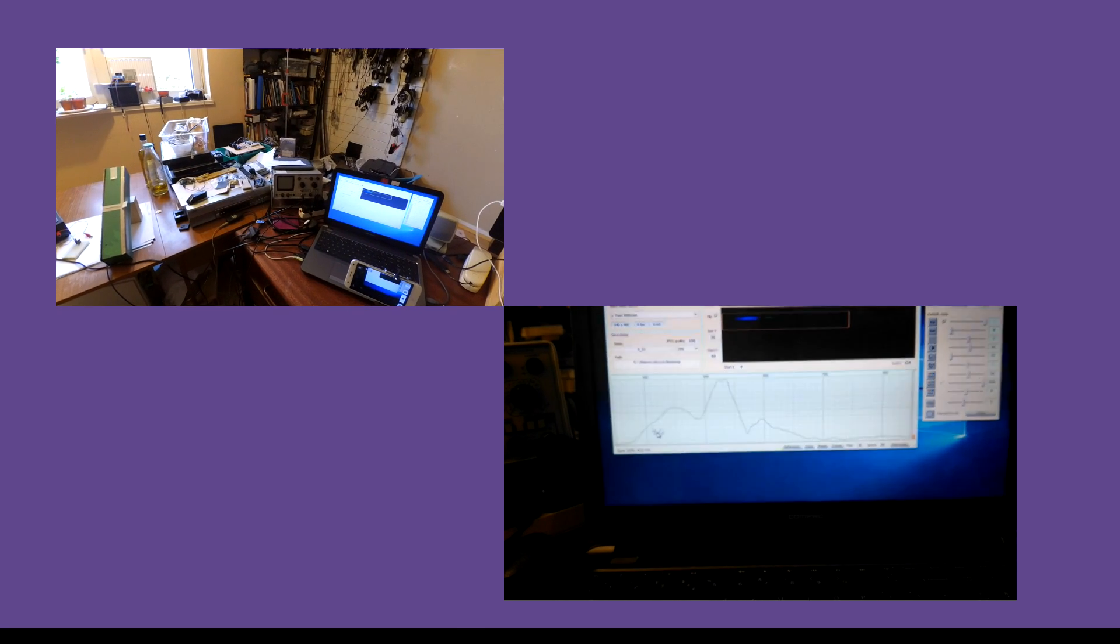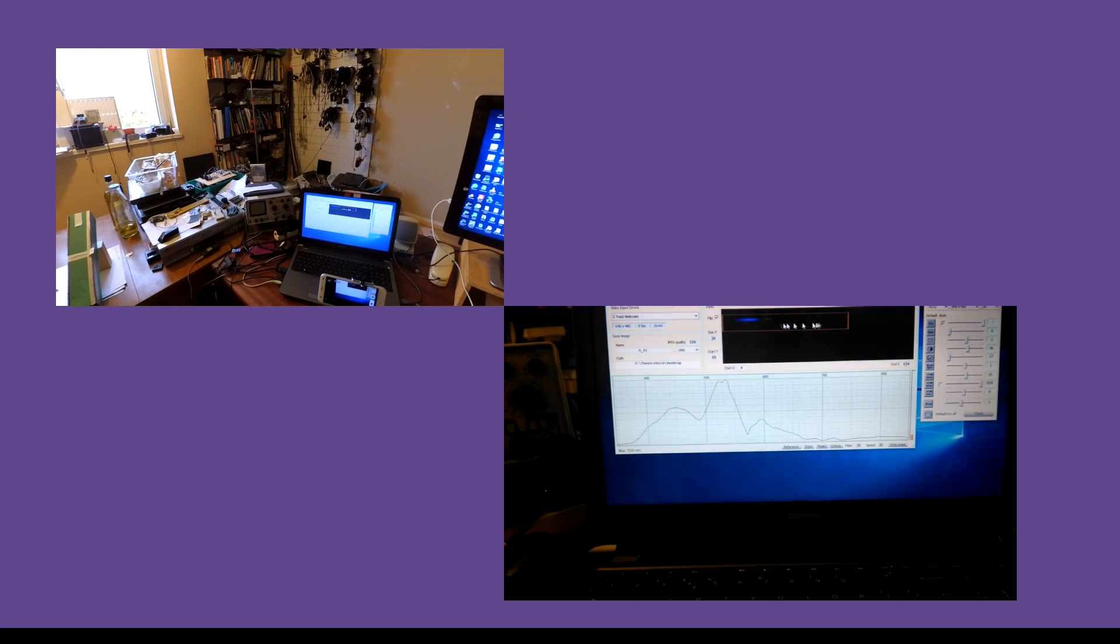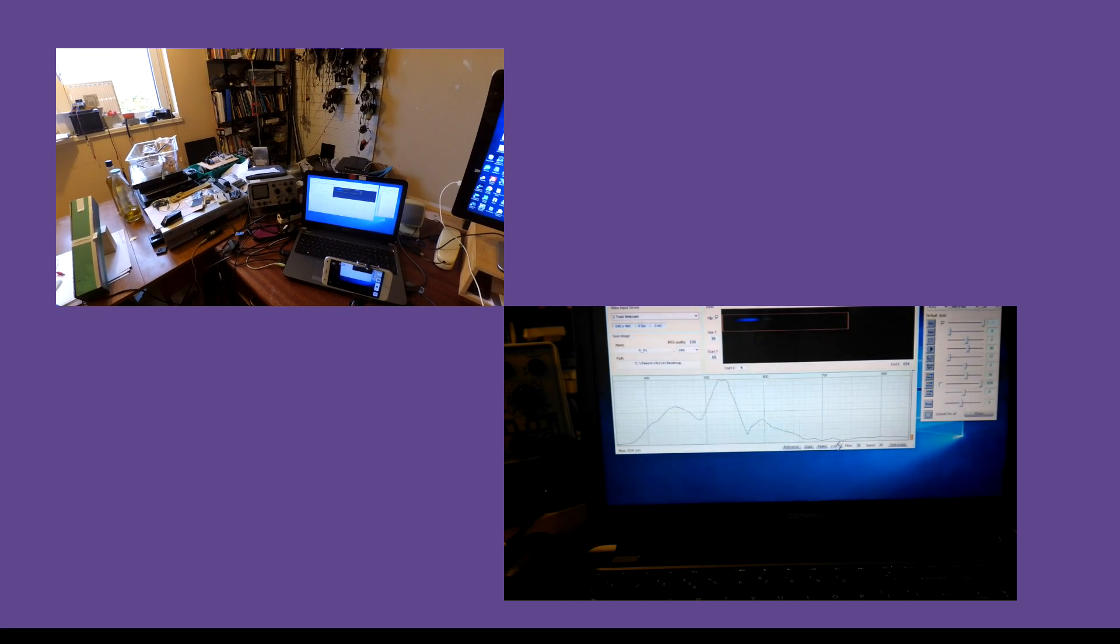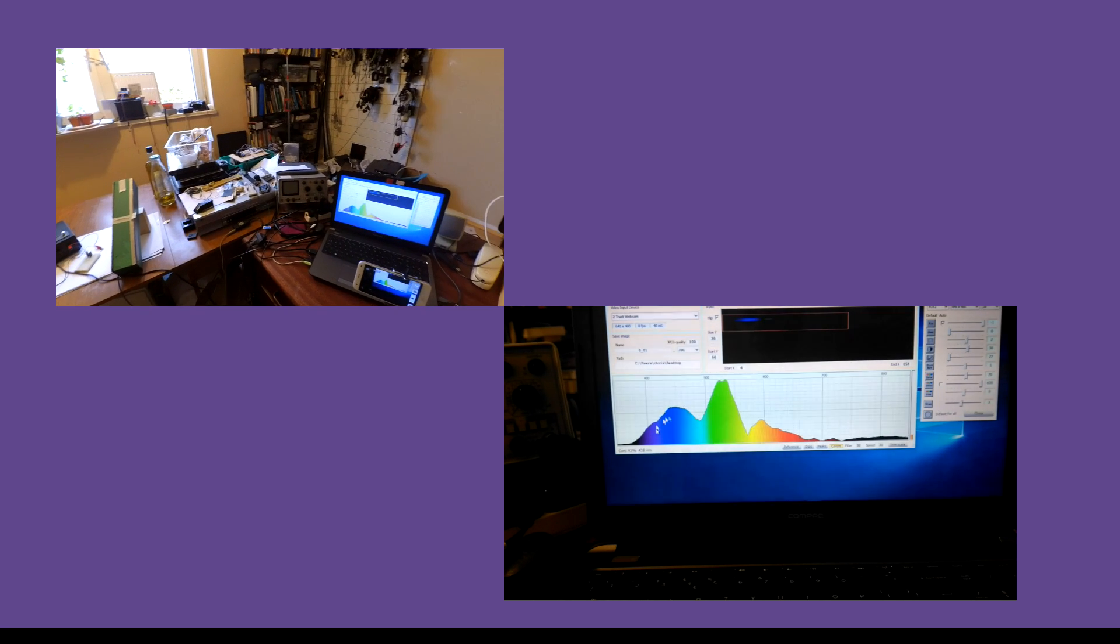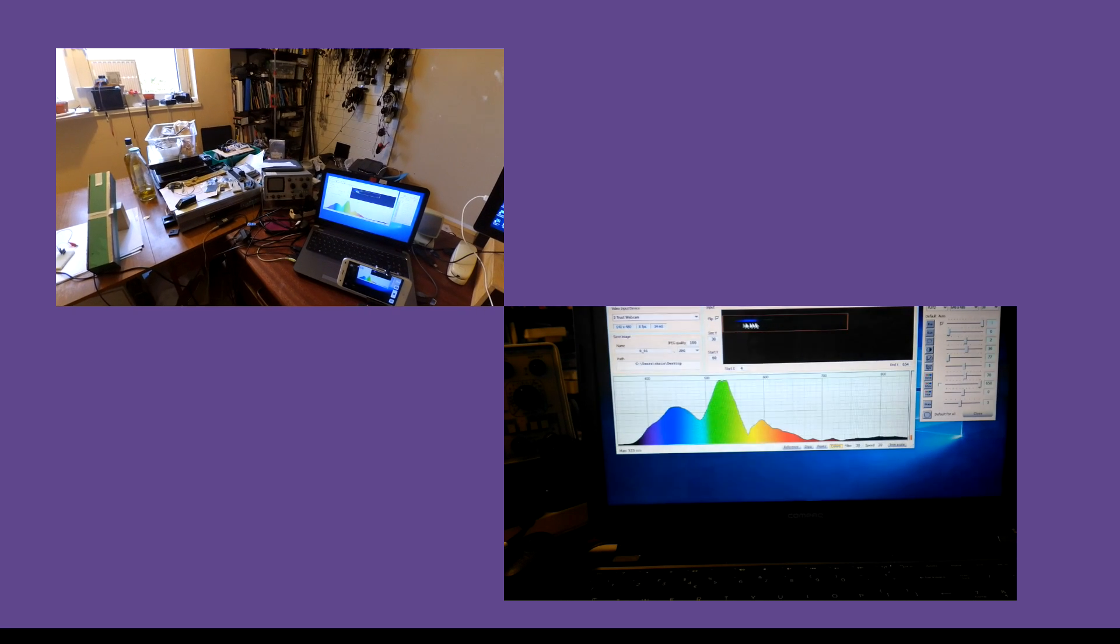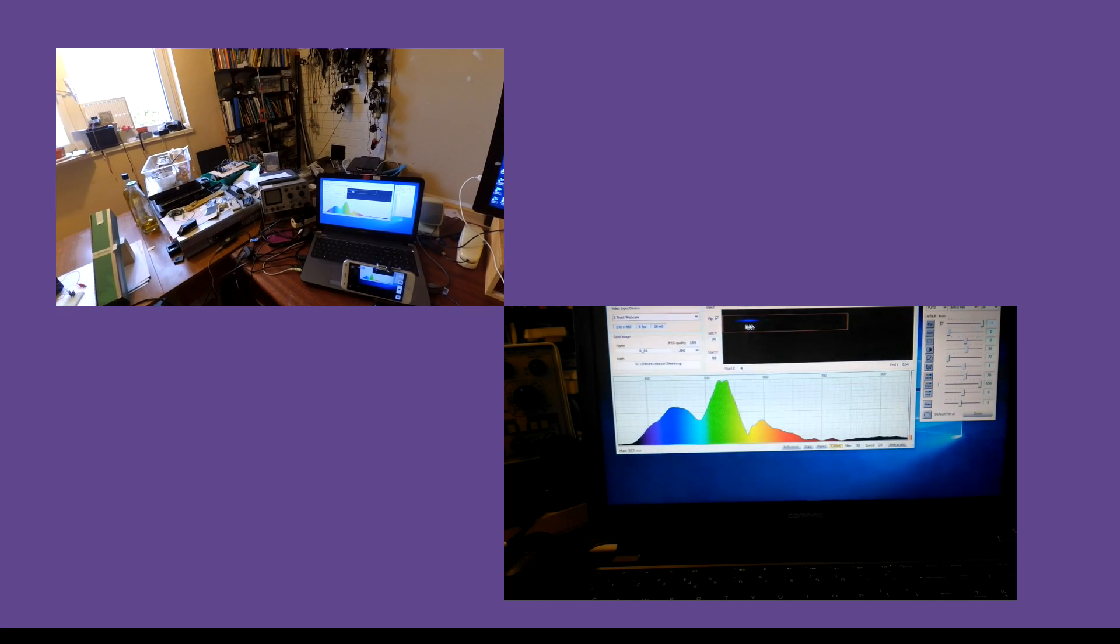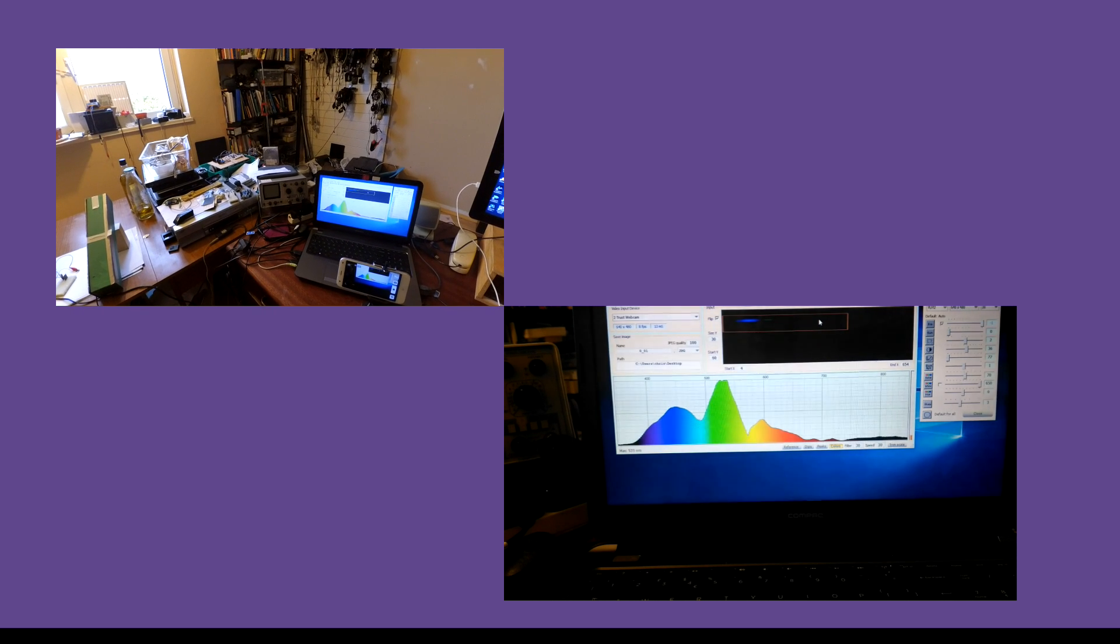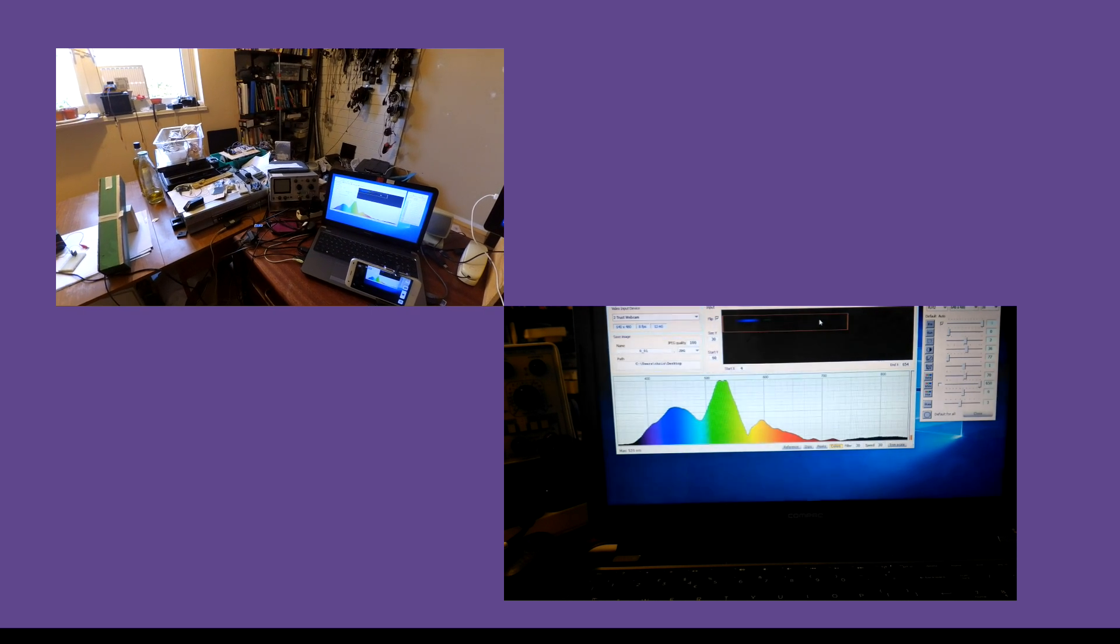This is just the intensity of light read from the web camera on this particular strip of its image. If you click colours, then it will project onto that an inference about the wavelength of the light at that place on its image. Remember, the light is coming from the diffraction pattern, so its angular displacement is proportional to its wavelength.